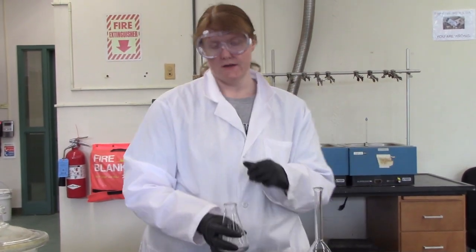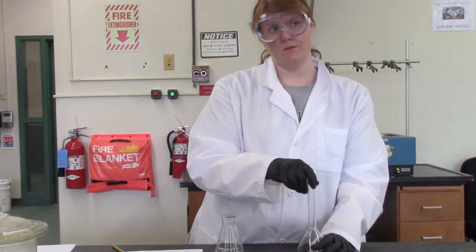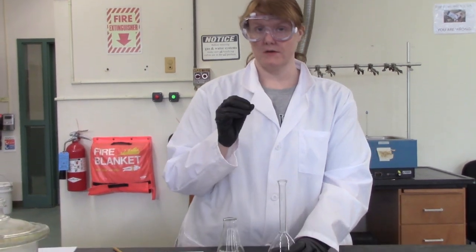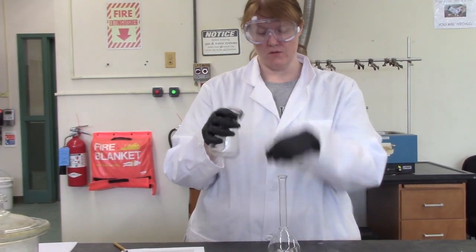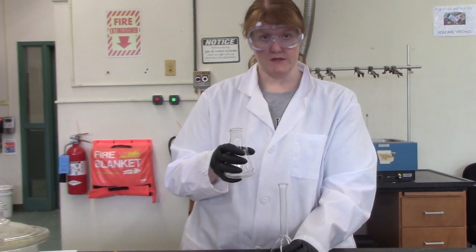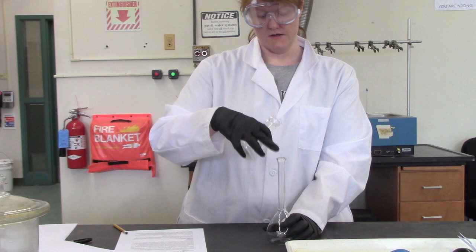The reason we don't just take the oxalic acid and try to force it into here is because about 50% of the time when we have a solid and we're trying to fit it into a volumetric flask, it's going to go all over the table. And then you have to clean everything up and start over again. We need that mass to be really specific. So by dissolving it in a small amount of water and then transferring it quantitatively, which means rinsing with water a few times and dumping it into our container that we're transferring to, we're trying to ensure that all of the oxalic acid ends up in there.